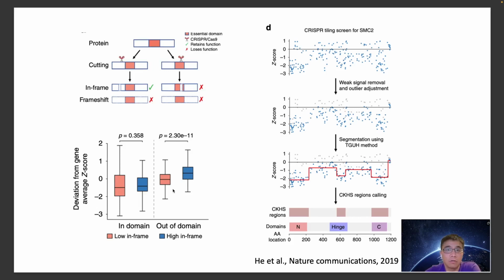While for out of domain, the low in-frame indels will cause a more significant phenotype than the high in-frame ones. So this further supports our argument about this tiling screen analysis.